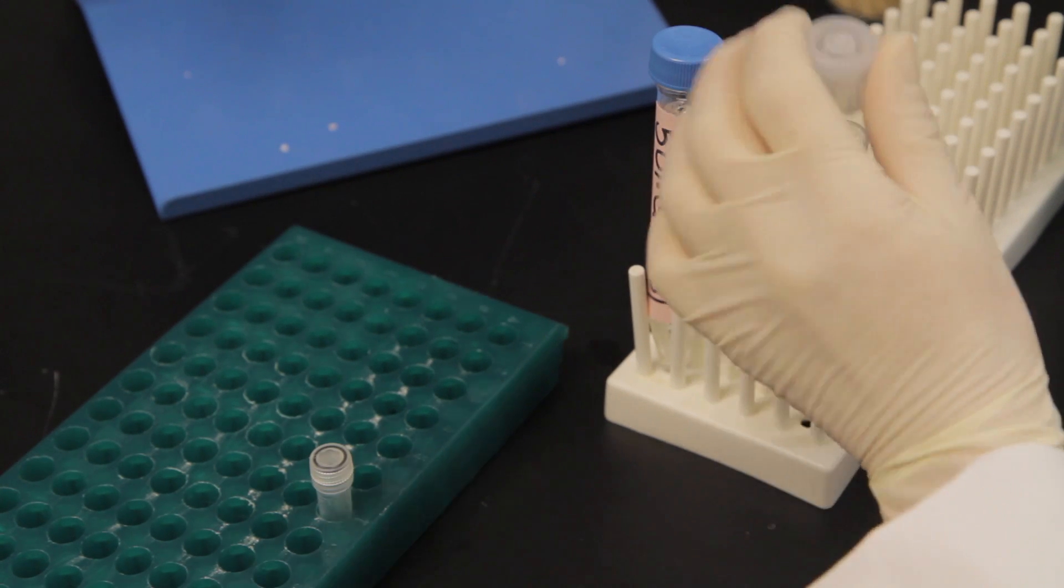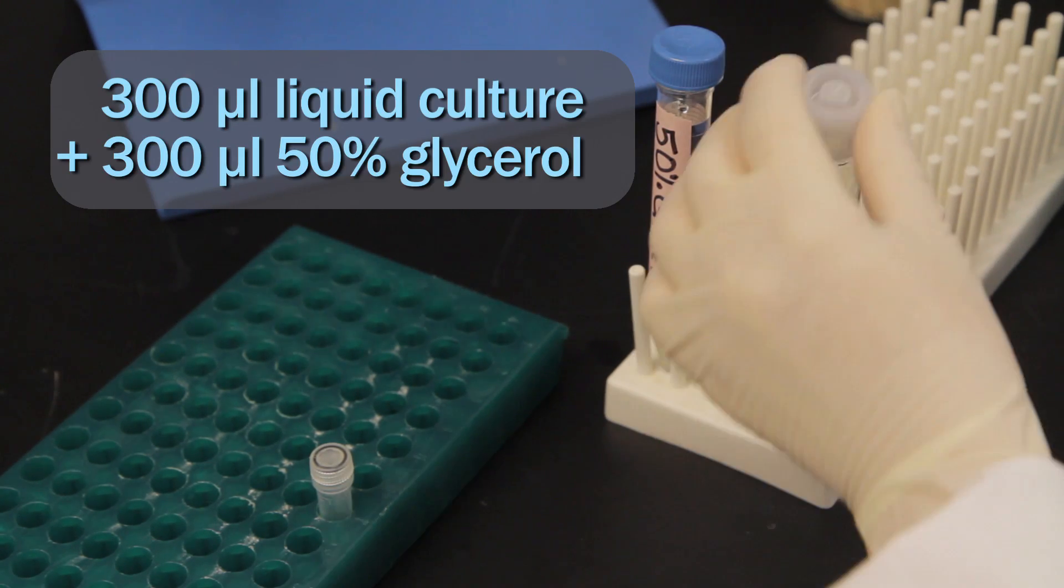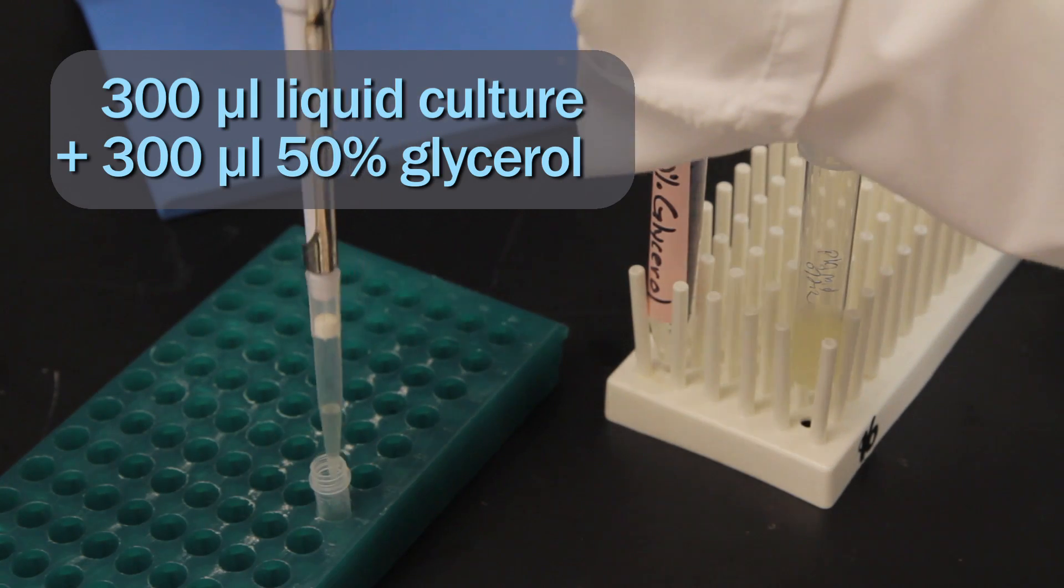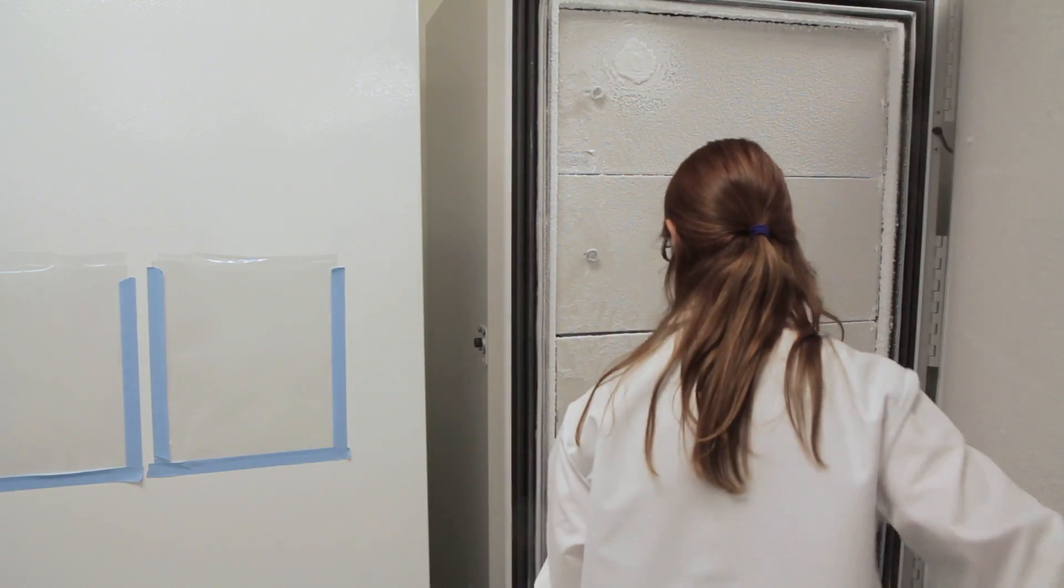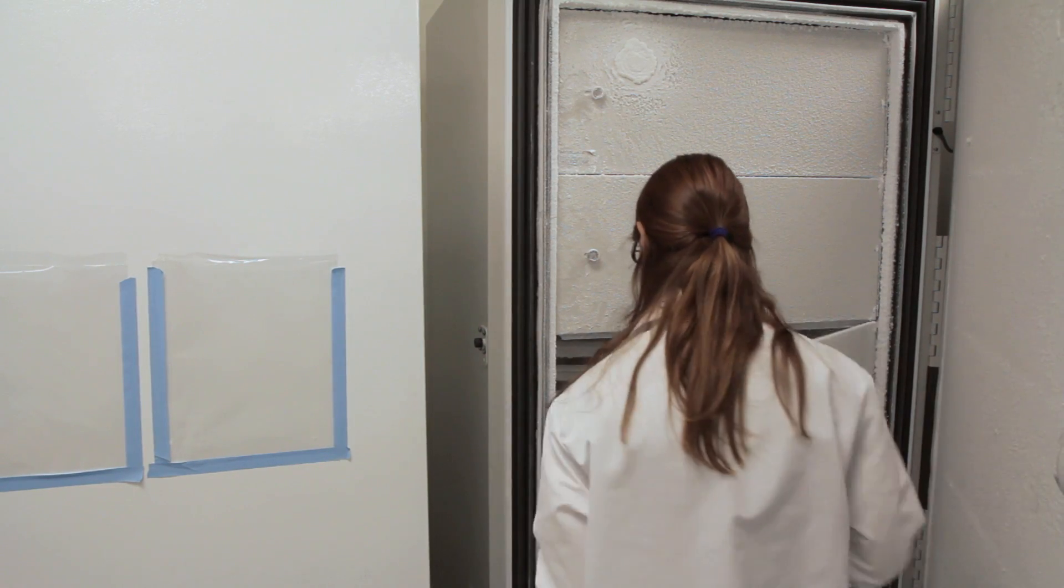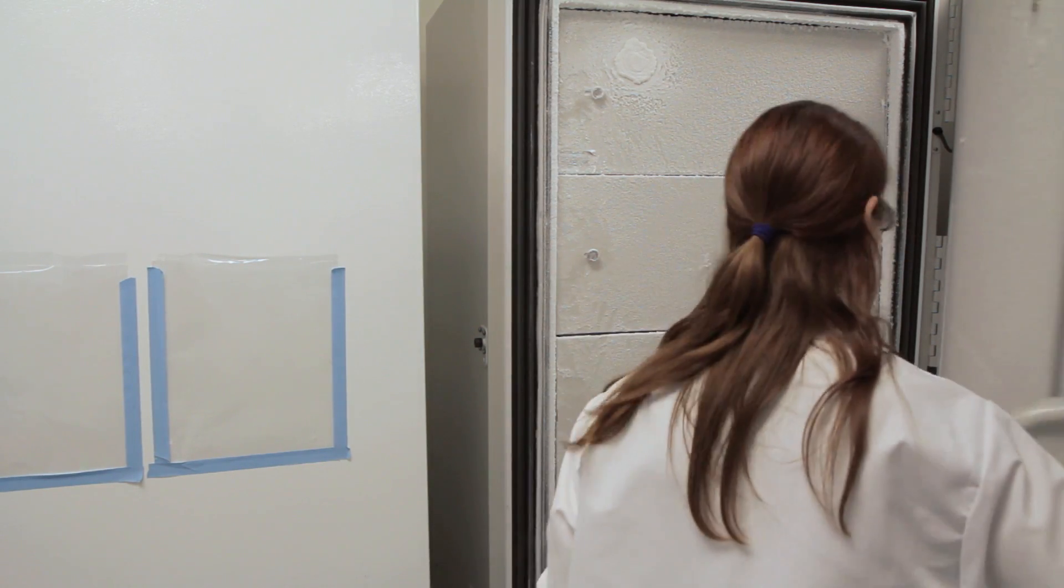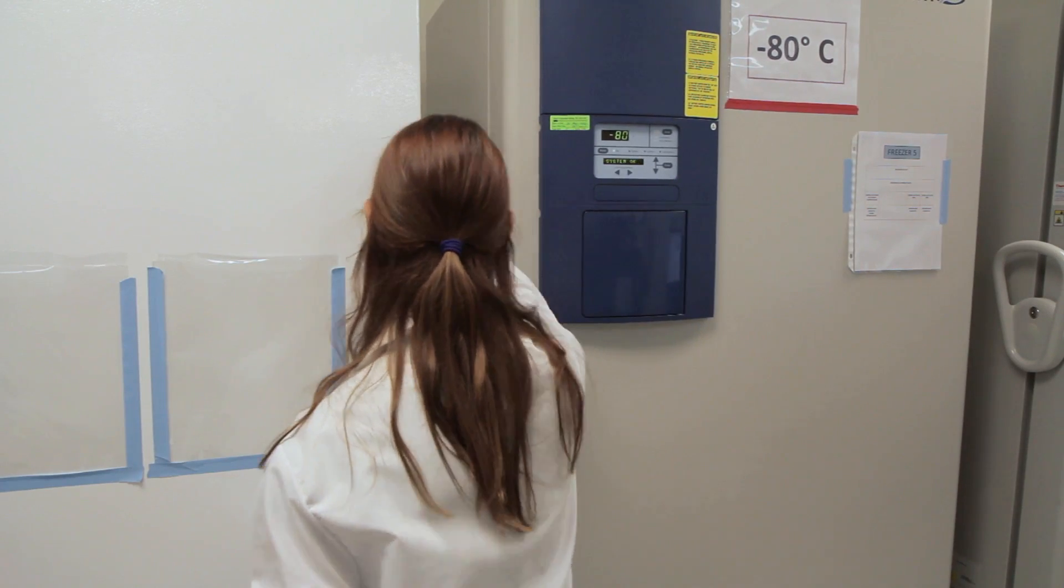Use the bacterial culture to create glycerol stocks by mixing 300 microliters of the culture with 300 microliters of 50% glycerol and storing at minus 80 degrees Celsius. Bacterial glycerol stocks are usually an excellent way to store your plasmids for the long term.